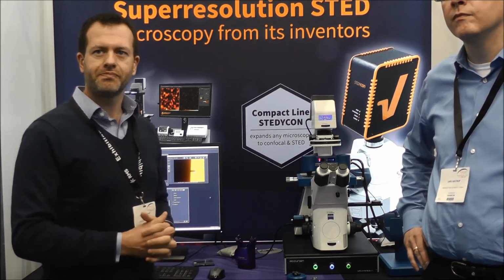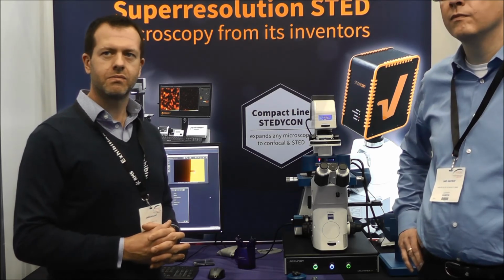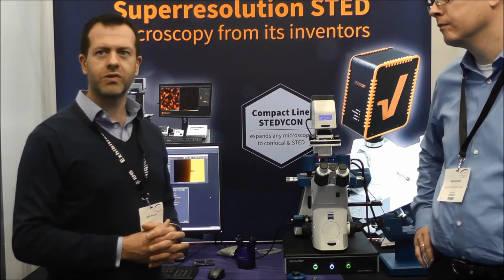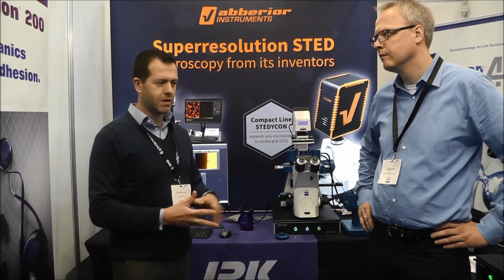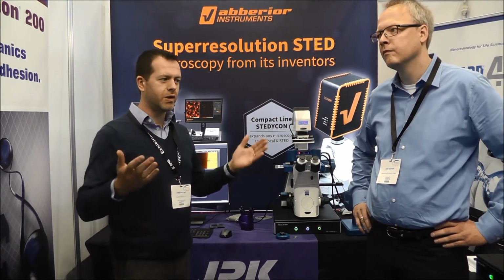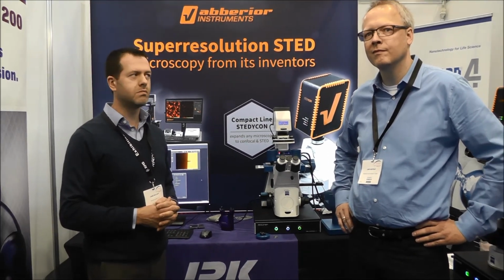So that's a fantastic example of correlative microscopy, and that must make productivity so much easier to boost. Absolutely. When you've got two techniques backing up one part of research, and you overlay with the same, so both techniques are showing exactly that same area, you're doubly productive.